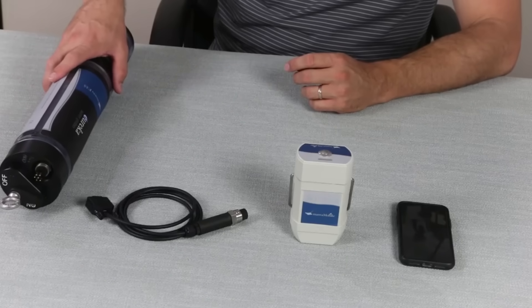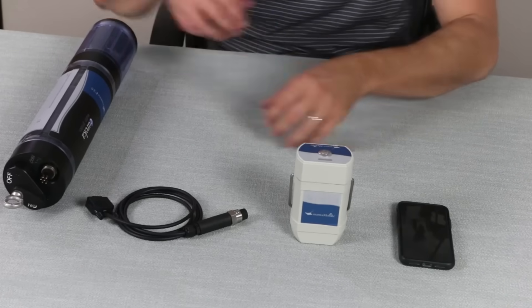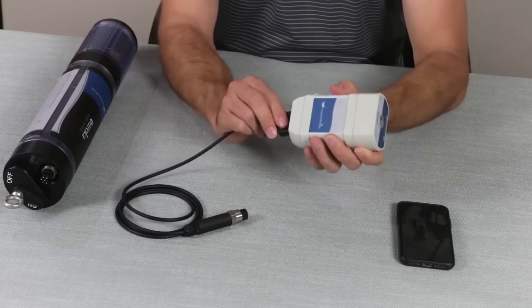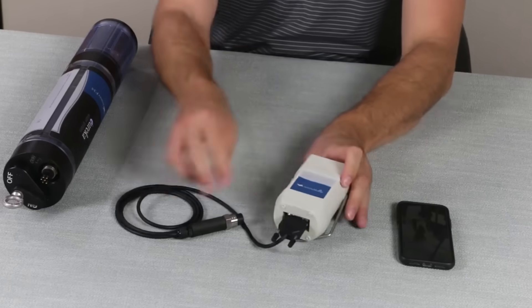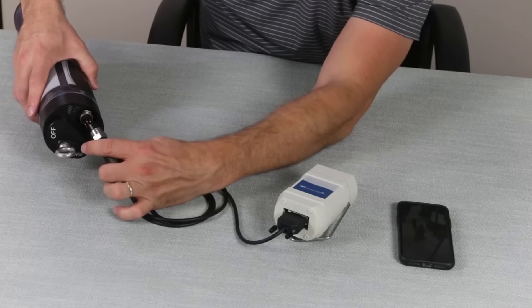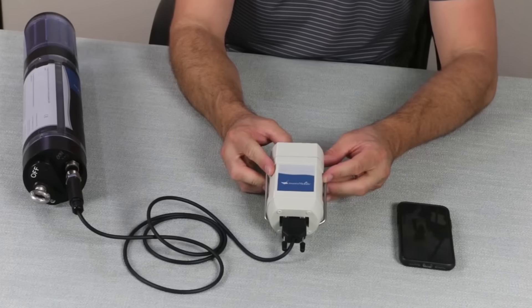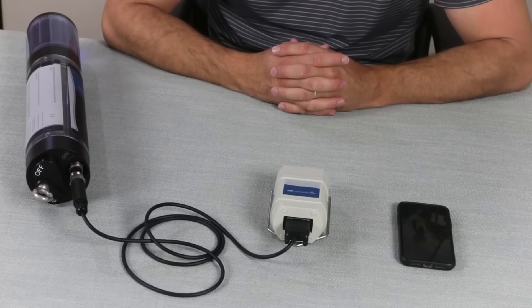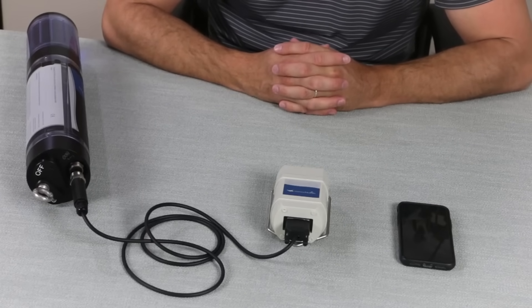Now that we have your probe all cleaned up, we're going to connect it to our Manta Mobile Bluetooth device. We'll connect our 9-pin end of our cable to the Manta Mobile and our 6-pin to the multi probe. Press the power button on the Manta Mobile Bluetooth device. Then we'll tap the icon on our phone or tablet to start the MantaLink program.